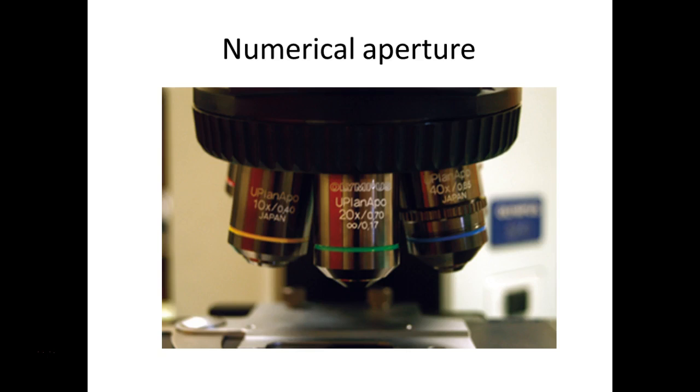The ocular is what you look through, right? Those are usually fixed at around 10x, so 10 times magnified with just that one lens. But most of the light microscopes we use are called compound microscopes. They combine the objectives, which you can change between the different magnifications, and the oculars, which are fixed. Each one is usually on a revolving nose piece, right?